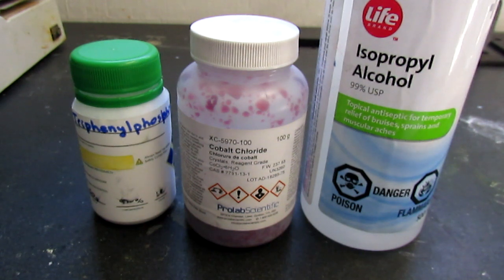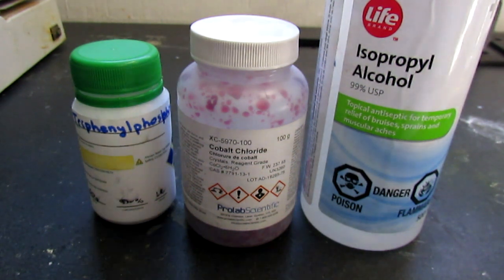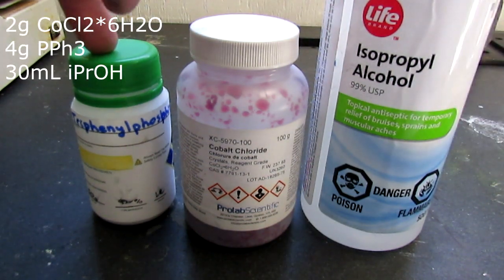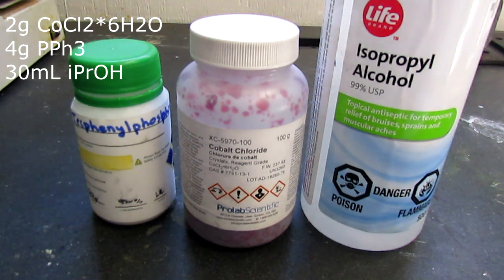We're going to start with the bis(triphenylphosphine) cobalt chloride complex. To do this we're going to use 2 grams of cobalt chloride hexahydrate and 4 grams of the triphenylphosphine, and we're going to dissolve the triphenylphosphine starting in 30 mL of isopropyl alcohol.